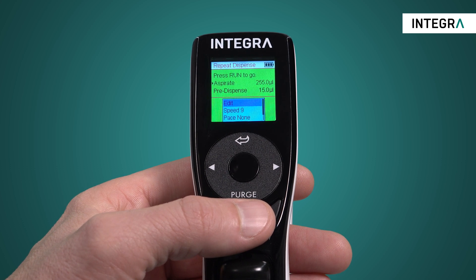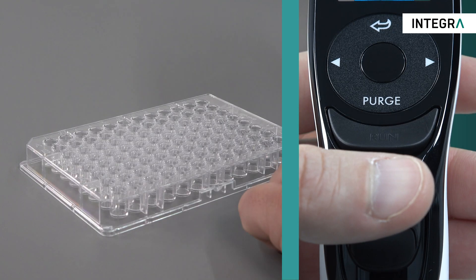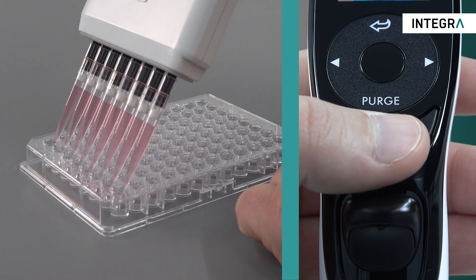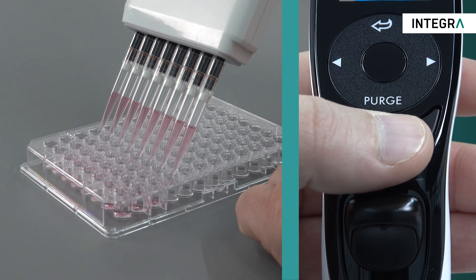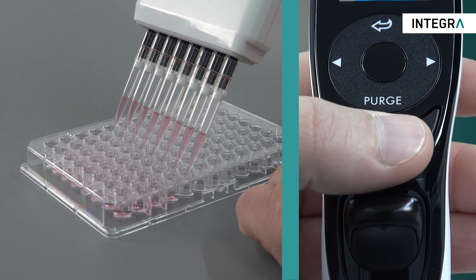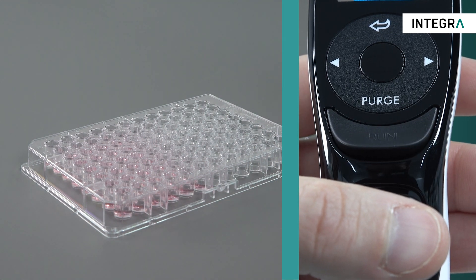By the way, the pipette automatically calculates how much needs to be aspirated. Another great feature with using the repeat dispense mode is the pace function. This sets the time interval between dispenses if you simply hold the run button down, so you don't have to press run for every individual dispense.